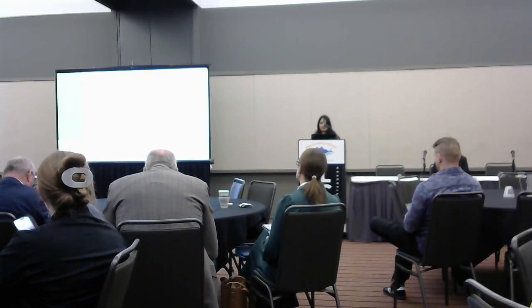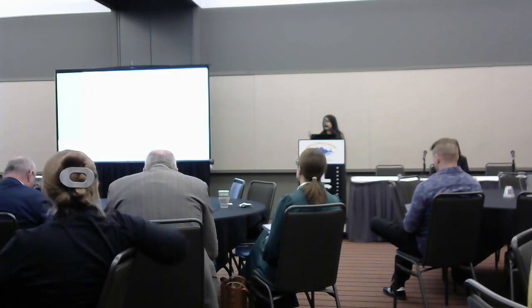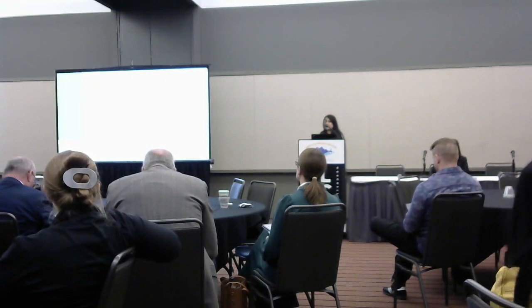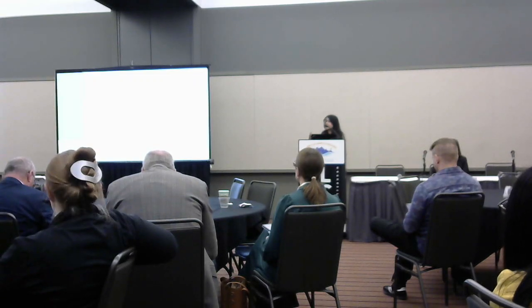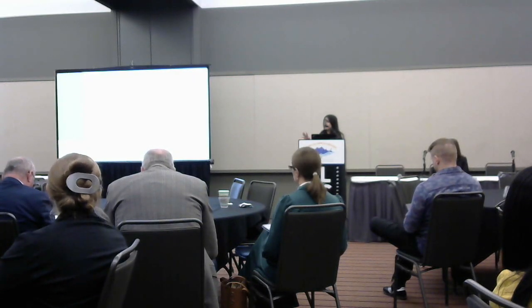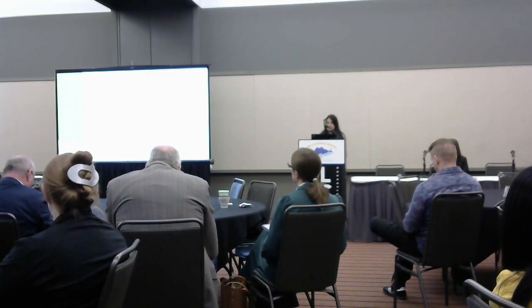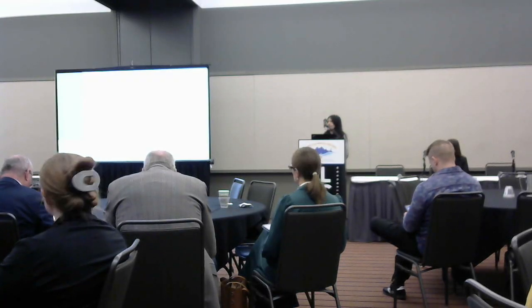We have 3 confocals, and all of them have a super resolution module on them. And whether it's Airyscan or SoRa, what we have seen is the images that come out of the system, they have larger bit depths, they have smaller pixel size. So we are not just dealing with bigger files, but these files also often need some form of deconvolution or intense post-processing workflow before the actual scientific analysis can begin. And one more instrument that I want to highlight here is our SmartSPIM light sheet from LifeCanvas Technologies.